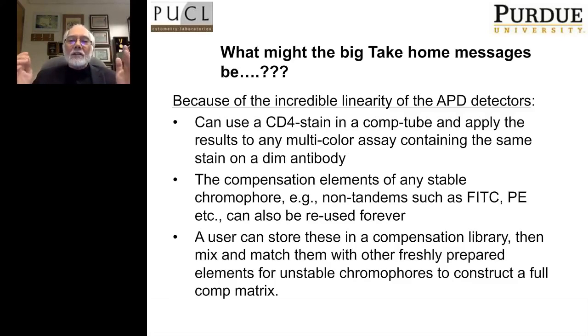What I understand to be really unique is that because of the linearity of this system, it will change the way things like compensation can be done. My understanding is that because of the extreme linearity, compensation in this system can cross different samples and different dyes.